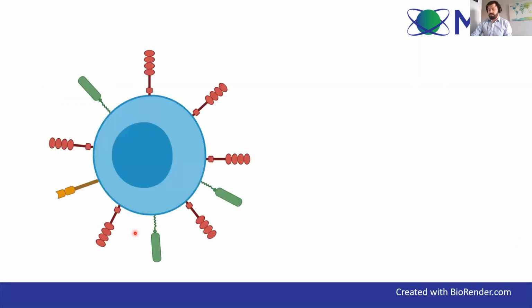So we'll bring back in our cell here, and we'll consider what we know now. So we know we want to detect these 3 markers on the cell surface, and this goes if you've got 3 markers or you've got 10 markers. The same principle applies. I've just done 3 today just for clarity. So if we look at our red receptor, it's very abundant.